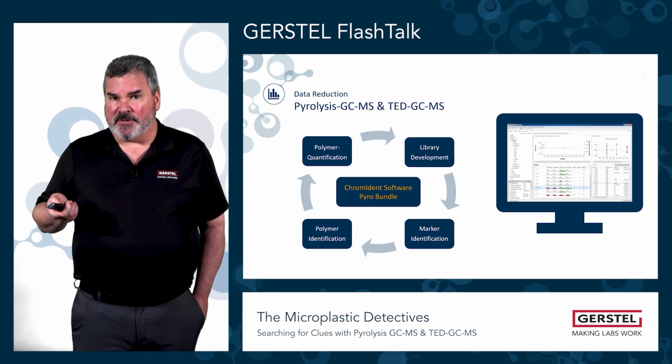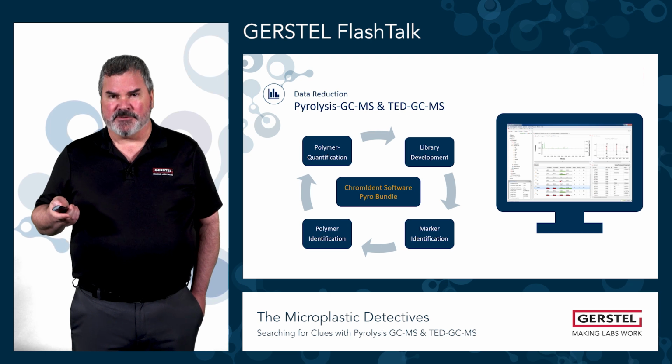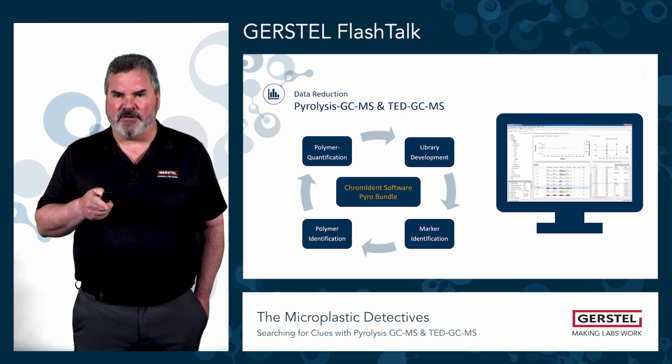For polystyrene, there's typically 3 marker peaks. For polyethylene, there's dozens of marker peaks. One way or the other, we're going to look for those marker peaks, and we're going to match the sample against these marker peaks, looking to identify it.